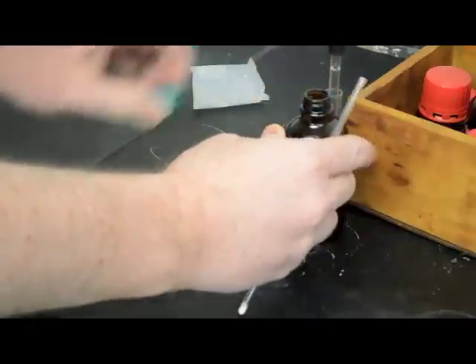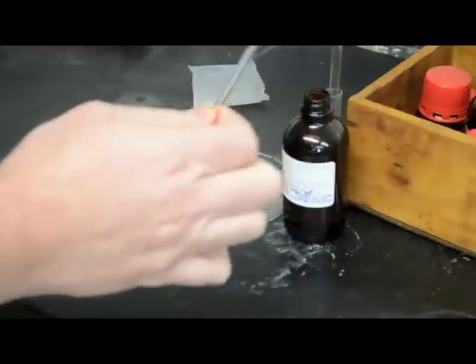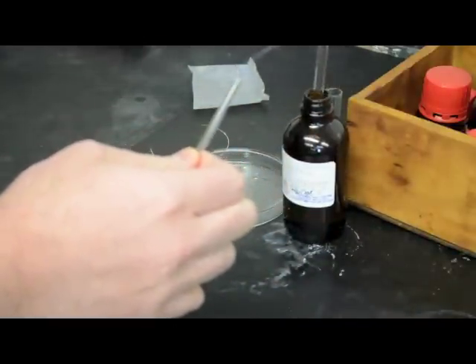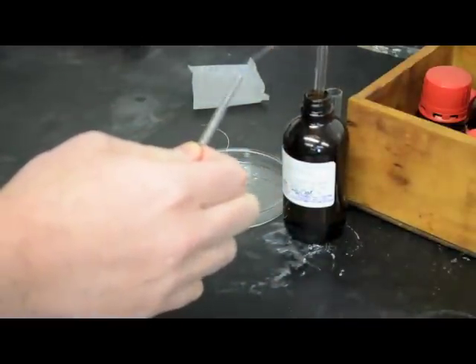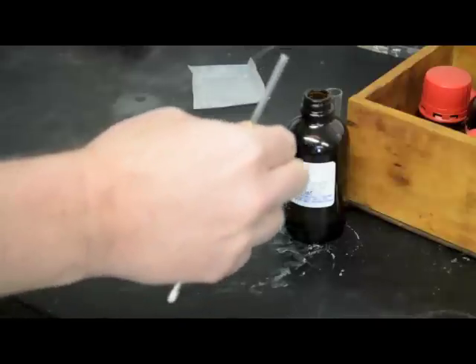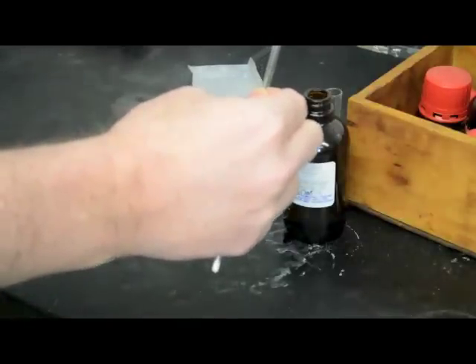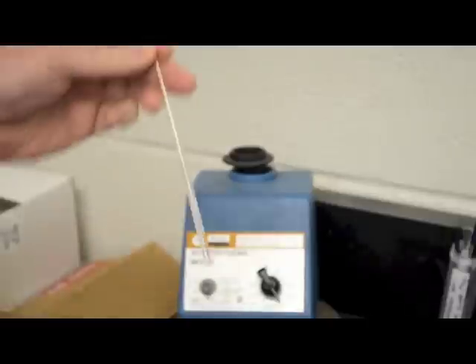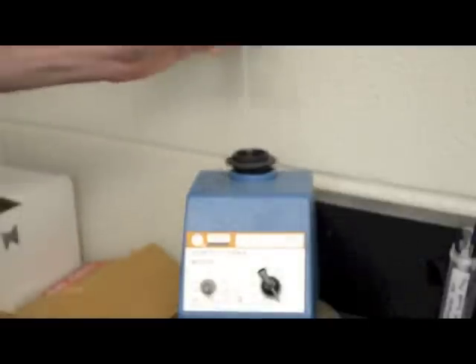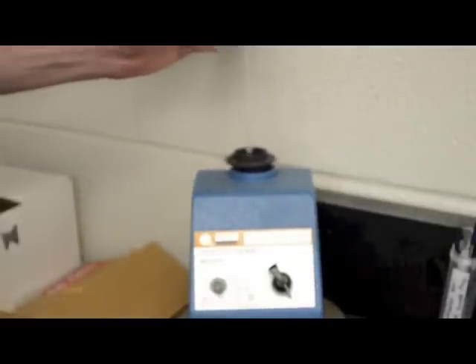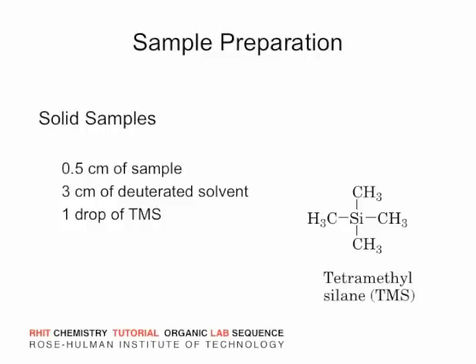Here, I am showing the use of the deuterated chloroform from our solvent stock bottle. After you've added enough of the solvent, you need to make sure that all of your sample is dissolved in the solvent before you carry on to the next step.